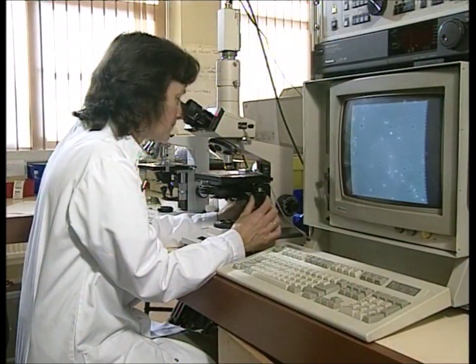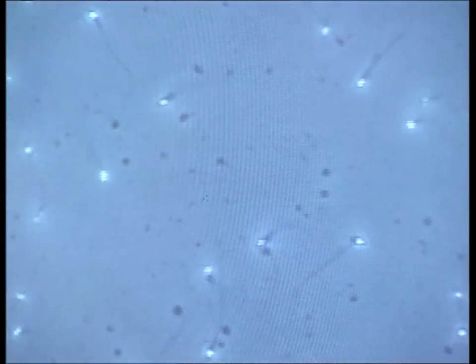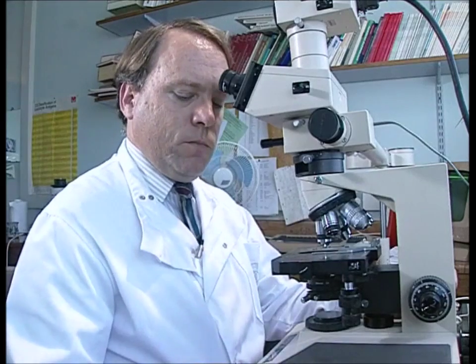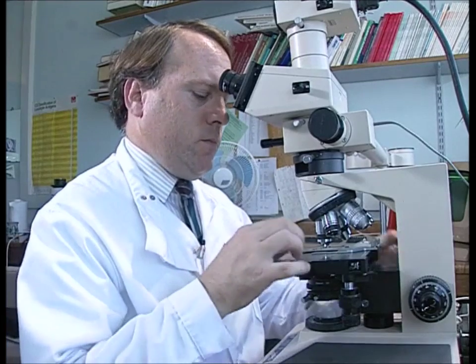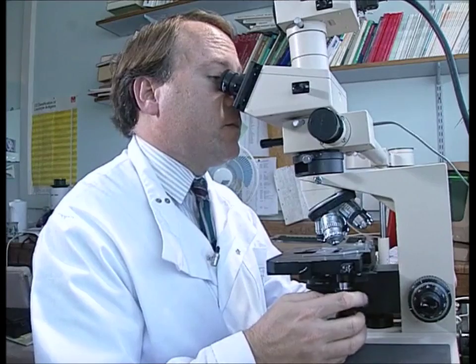Advances in the design of optics over recent years have led to a range of microscopic techniques which can be used to study the ultra-structure of biological material. Nowadays, microscopes are used routinely in a wide range of scientific applications.